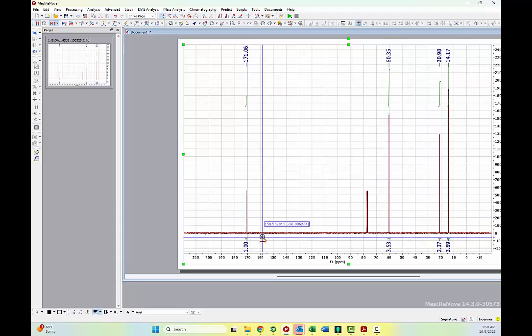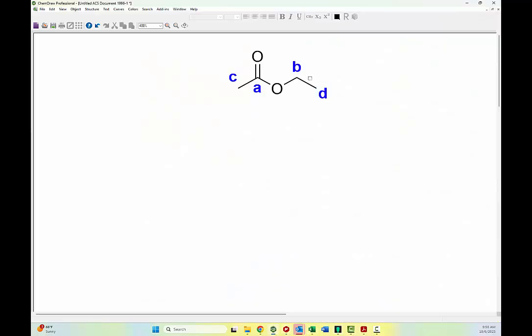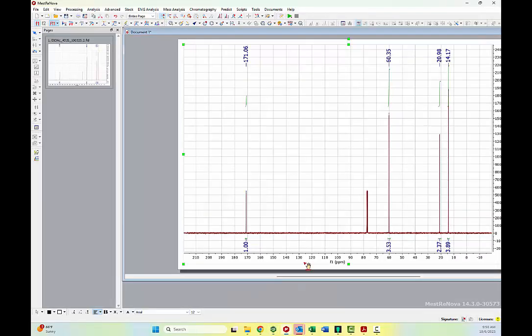That being said, there are other issues at play here as well. But again, even looking at these three that contain hydrogens bound, so this is the carbonyl carbon, it does not contain a hydrogen bound to it. All of the other three are more similar to each other than not. 3 hydrogens bound, 2 hydrogens bound, 3 hydrogens bound. If you look at the C13 spectrum, all the ones that have hydrogens bound are much larger than the carbonyl carbon, but they also end up quite different from each other if you try to do the integration.